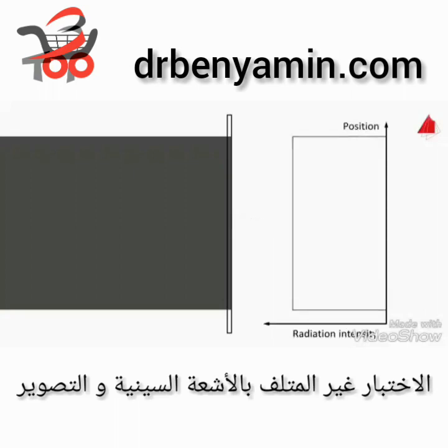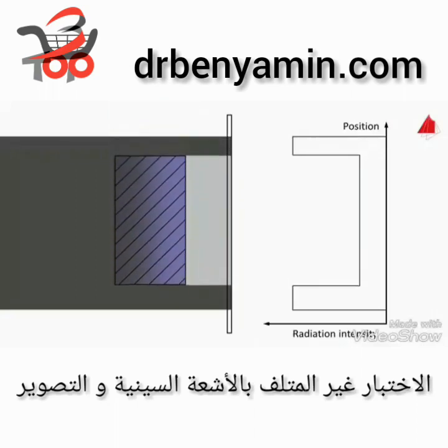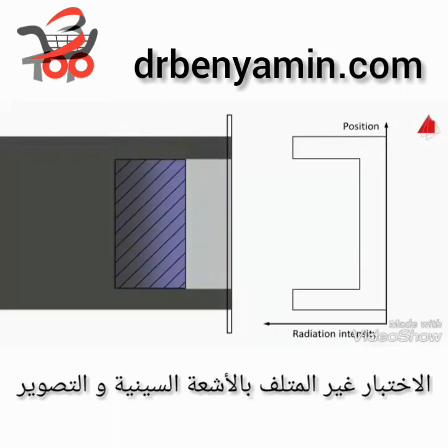When the radiation intensity is plotted as a function of the position, a uniform distribution is the result, as shown here. At each point, the image capture unit records the same radiation intensity. But what happens to the diagram when a material sample is placed in the radiation path? The sample absorbs part of the X radiation. The principle is, the thicker the sample in the direction of beam propagation and the higher its density, the less radiation reaches the image capture unit.